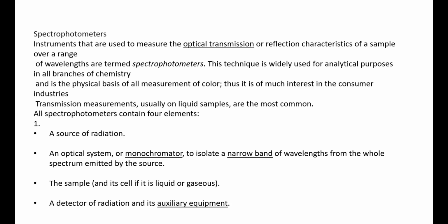So from the light source, only a specific wavelength is selected, say 267 nanometers, 271 nanometers, 280 nanometers. For IR I am talking about a much higher range, up to thousands, 4000, near IR, far IR, etc. So in the nanometer range, you can choose a single wavelength, and that can be selected depending upon what your analyte is. How to select that we have done in the practical. In the next lecture, we will discuss that.